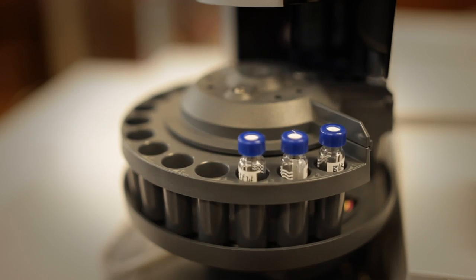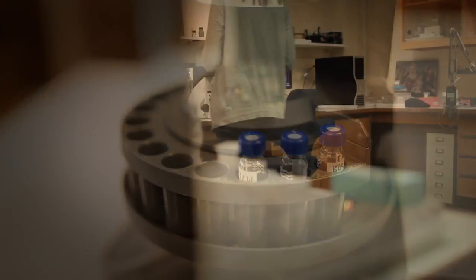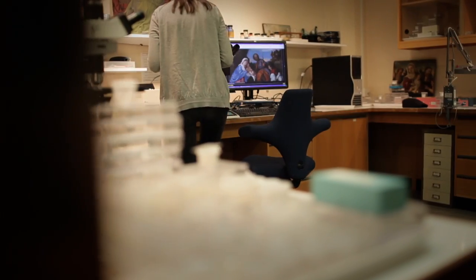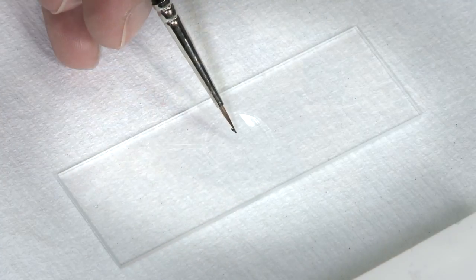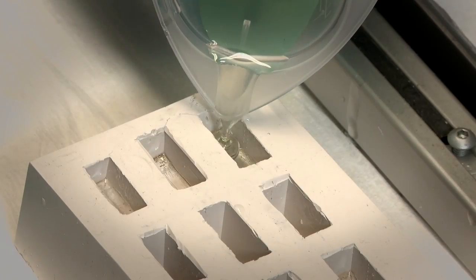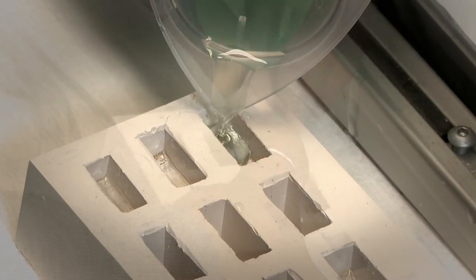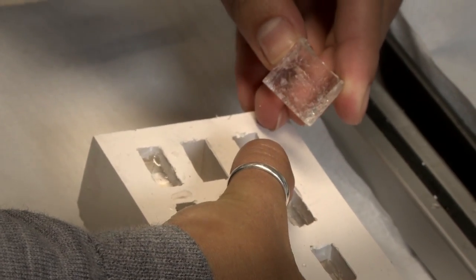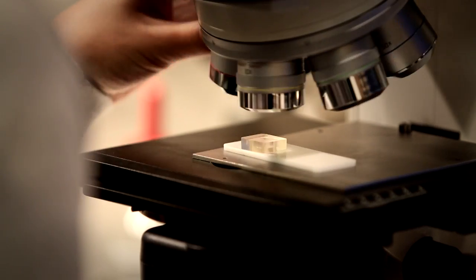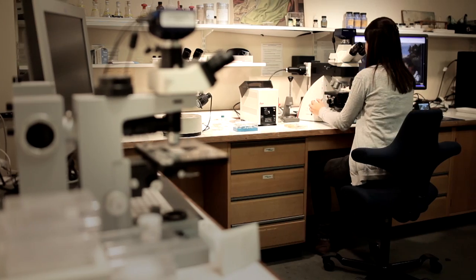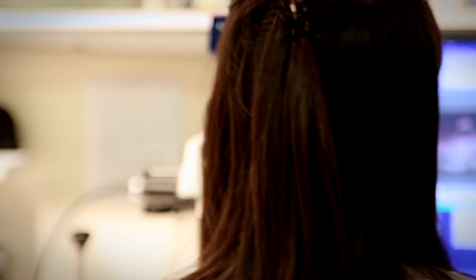At the National Gallery Scientific Department, a tiny sample of paint, usually taken from the edge or from underneath the frame of a picture, is immersed in resin, dried and then ground down to produce a cross-section. This cross-section can be examined at high magnification under a microscope.